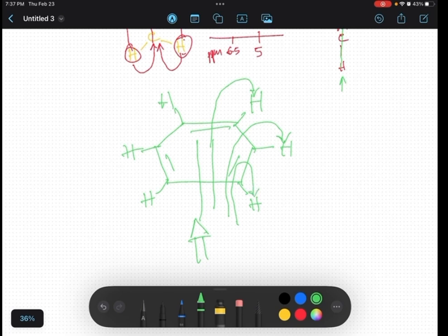So it will make this proton more de-shielded because of this magnetic effect.